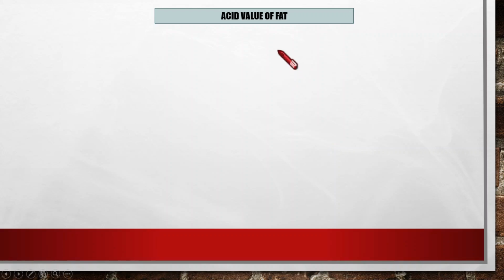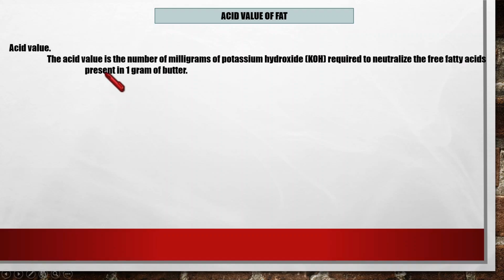Good morning, dear students. Today we are going to do a practical to find out the acid value of a given sample of fat. So, what is acid value? I'm sure that you have learned about this acid value in your theory. Anyhow, let's see the definition.